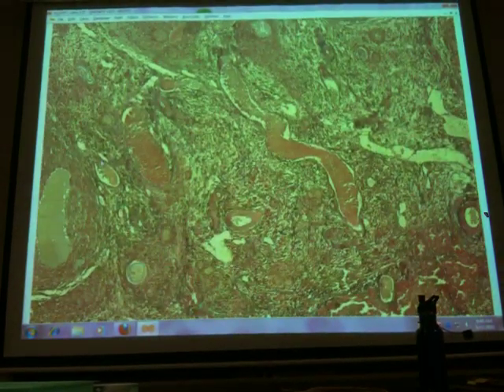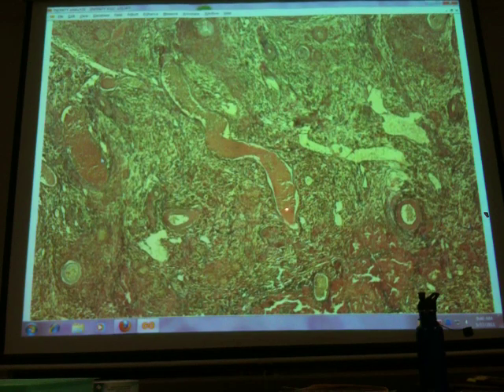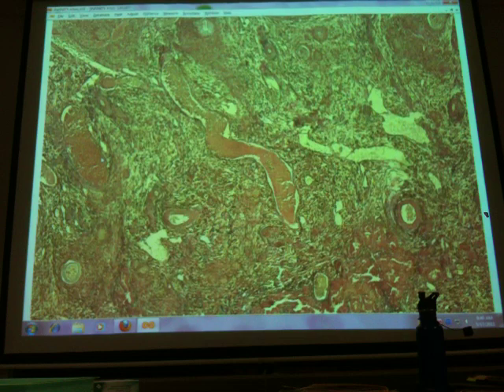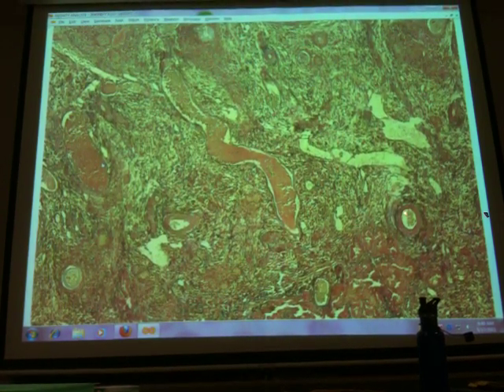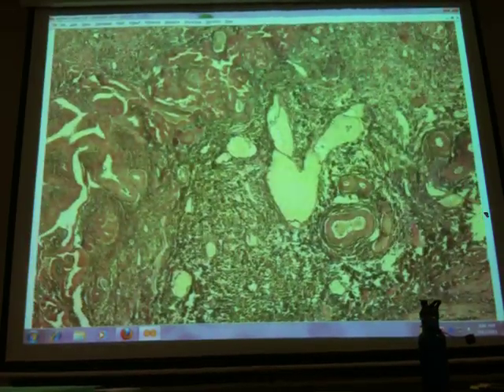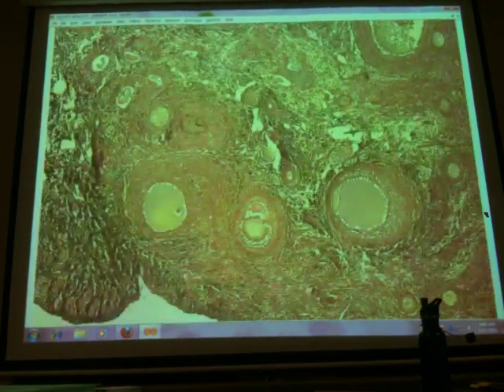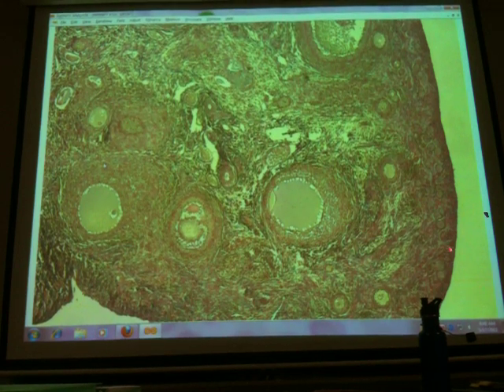But as we come into the middle here, where we just have blood vessels, and these are actually little arteries, this is a longitudinal length along a vein, this is ovarian medulla. Okay? We don't have the follicles. Yes, we have some openings, but if we look at higher power at these lumens, you'd recognize them as arteries. So as we go across, we will eventually pick up, unless we're going out the hilus, which we did, we'll eventually pick up follicles, and this is ovarian cortex.